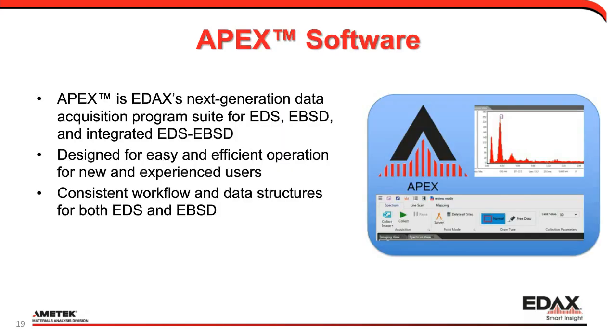The next thing I want to talk about is our new APEX software. APEX is the next generation data acquisition program that we've developed for EDS, EBSD, and integrated collection. And really from the ground up, it's been designed for efficient operation, both for new users and for experienced users. And part of that efficiency is having a consistent workflow and data structures for both applications. So if you learn something on the EDS side, it translates very well over to the EBSD side.